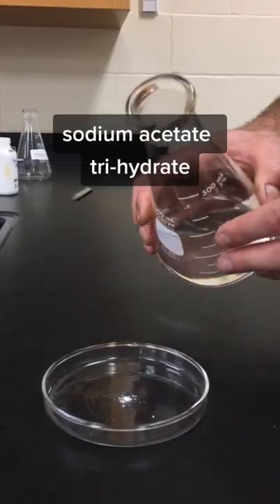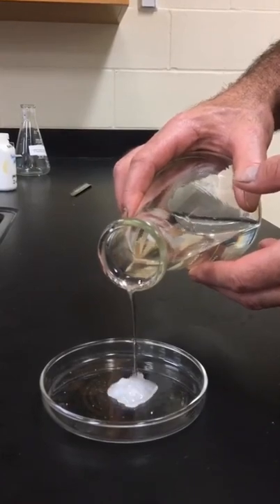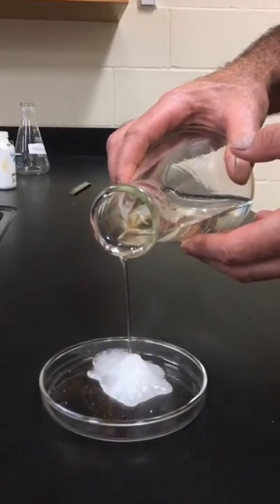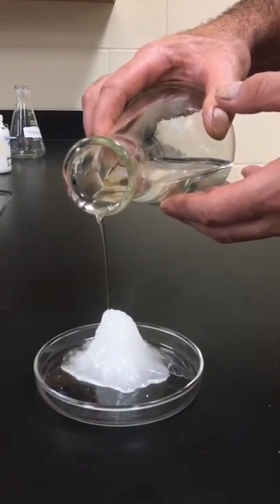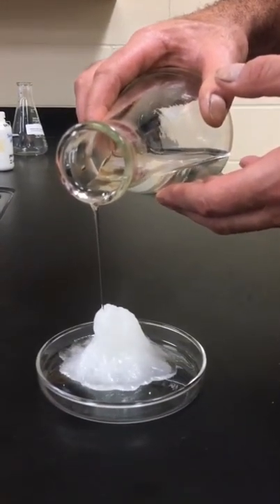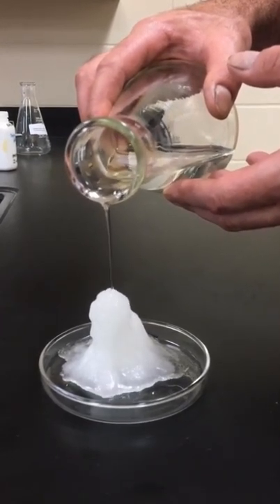Hey everybody, ChemClassRules here, and today thanks to a very persistent follower's request we're playing around with sodium acetate trihydrate. It's called trihydrate because for every sodium and acetate ion in the compound there are three water molecules, so the liquid in the flask can be described as a supersaturated solution, but it might be more accurate to call it a salt that's dissolved in its own water of hydration.